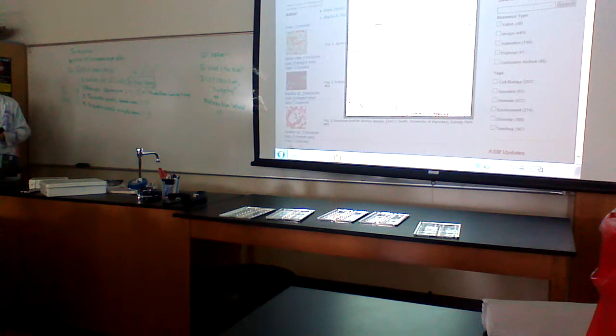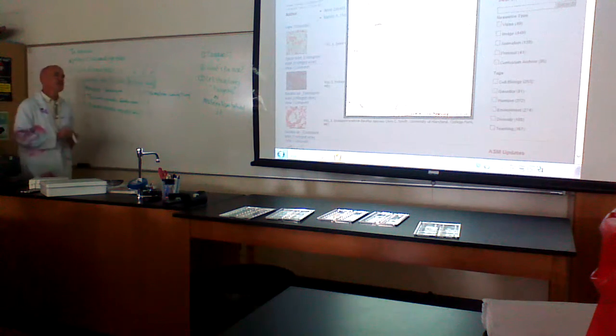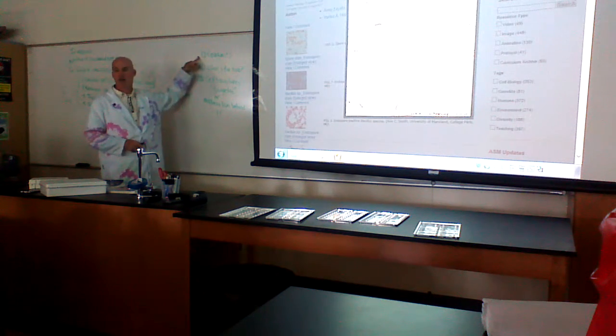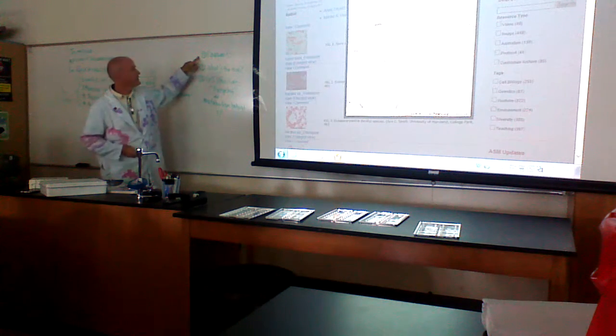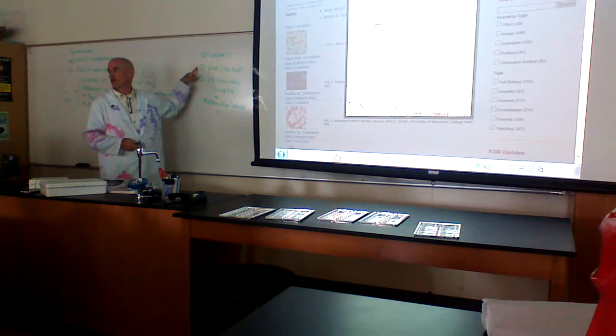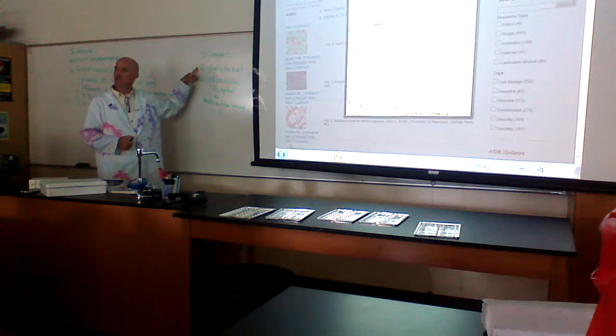Okay, so what would you ask us about this particular one? What test is this? What are the reagents? Right, malachite green. What was the trick in this one? Staining the spores, yes, but we had to do something special with the heat, the steam. The heat and steam, right. What cell structures are being targeted? The spore.